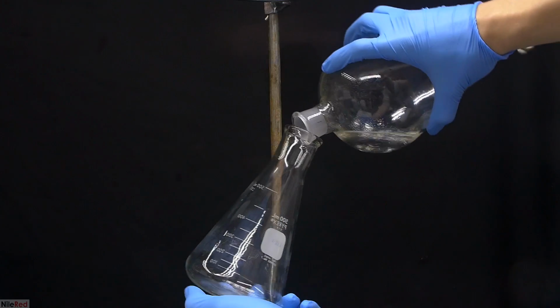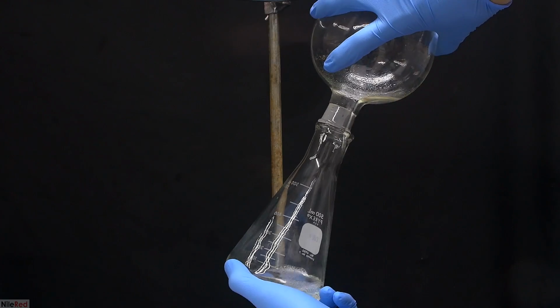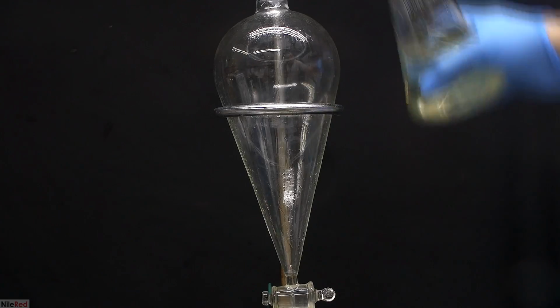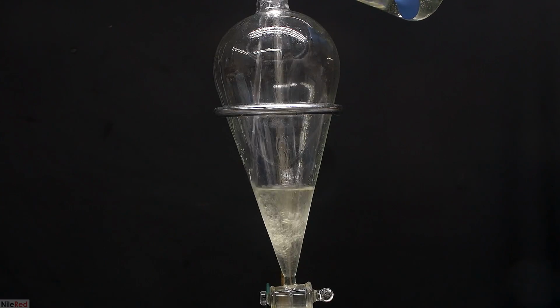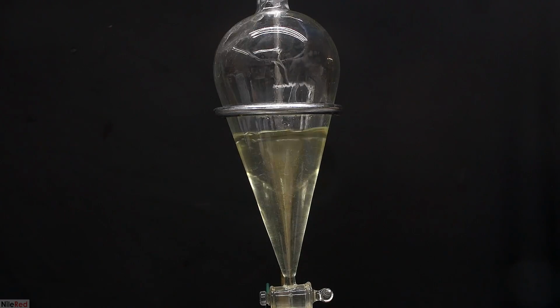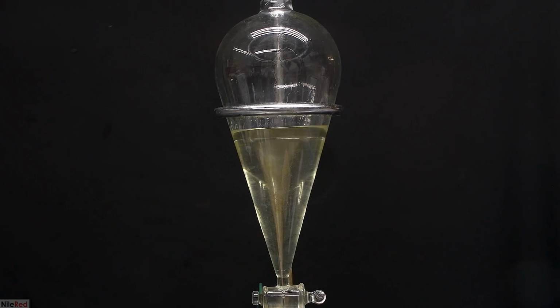After our lower aqueous layer has been drained off, I transfer the ether layer to another Erlenmeyer flask. The aqueous layer is transferred back to the separatory funnel, and we're going to try to extract as much caproic acid as we can from it.